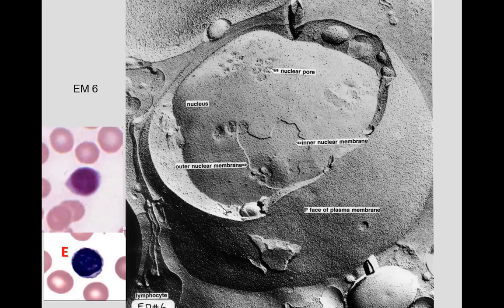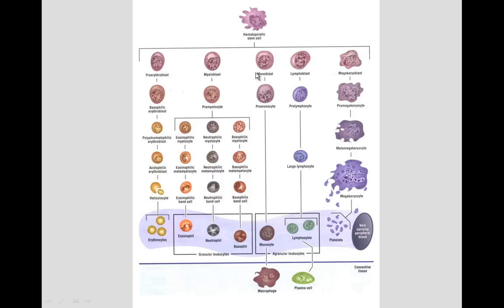Looking at a lymphocyte in carbon replica transmission electron microscopy, we see the lymphocyte with a little rim of cytoplasm, a big mostly spherical nucleus. In the nucleus we can see the nuclear envelope — the outer membrane and the inner membrane — as well as nuclear pores, which are one of the key structures to identify today.